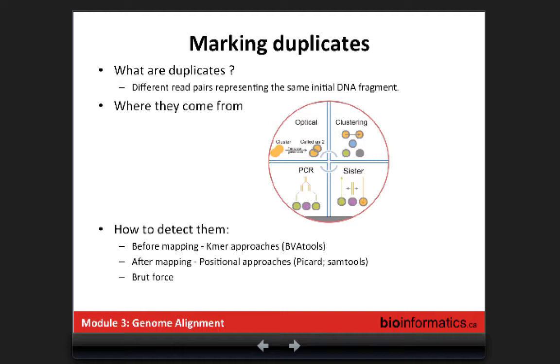In the new type of flow cell, when you don't load enough, you will have a free molecule. If the molecule is long enough, it will try to jump into an empty cluster position. Because you have adapters there, if no molecules went there during amplification and the molecule is long enough, it will jump and try to amplify in the other well.